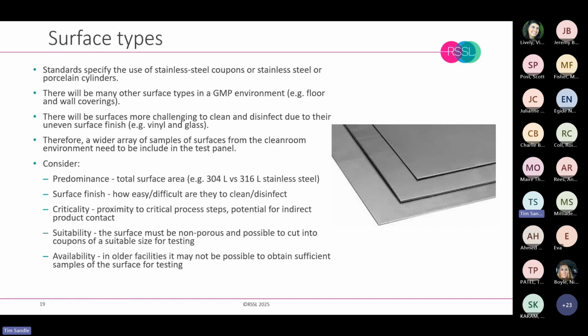If a given disinfectant is not used on a particular surface, then there's no point including it in its validation. So if we have our two main rotational disinfectants and we're also using IPA, but we're only using IPA on gloved hands, there's no point including that IPA within the surface studies. We're just adding to the cost.